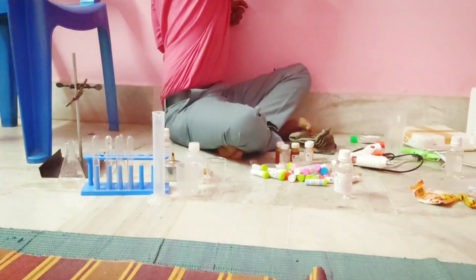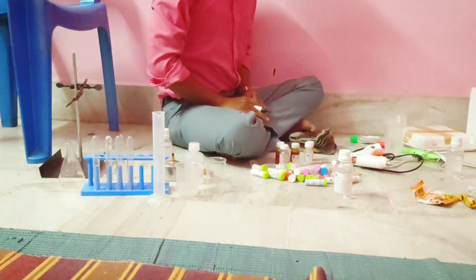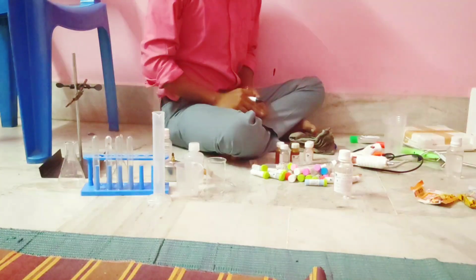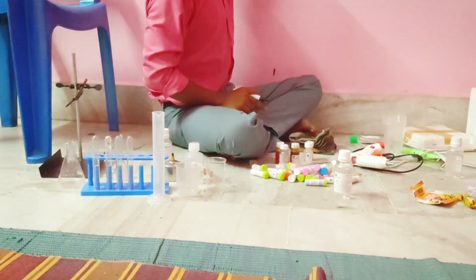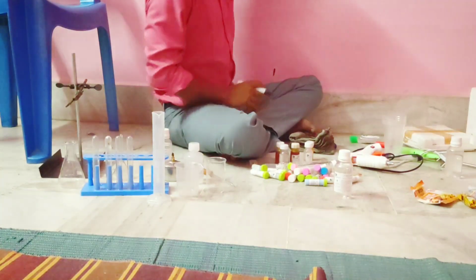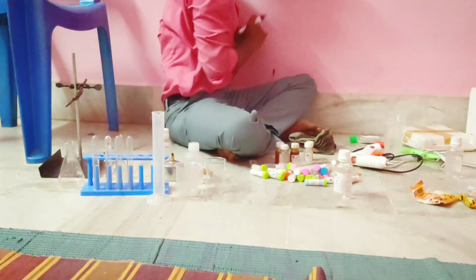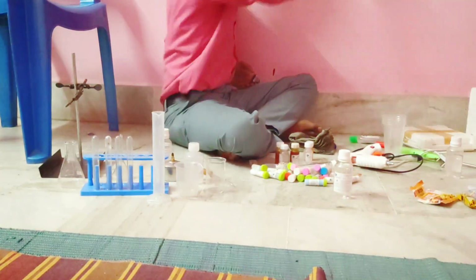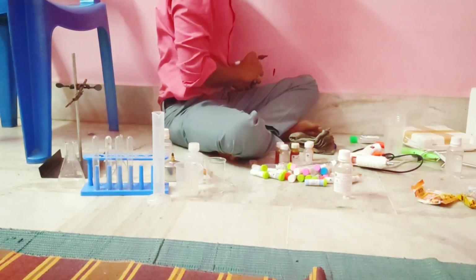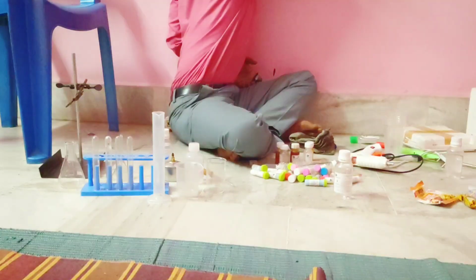I will bring some Tata salt, because they claim that it has a greater amount of iodine. We will add some starch, and then some lemon juice or vinegar to turn the medium acidic, to change the medium.